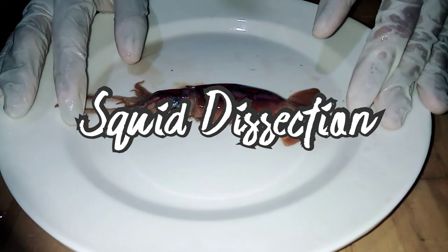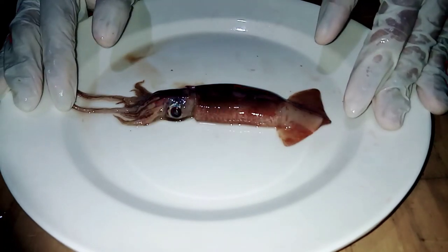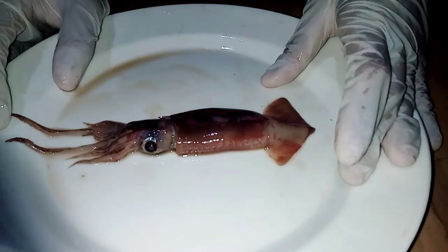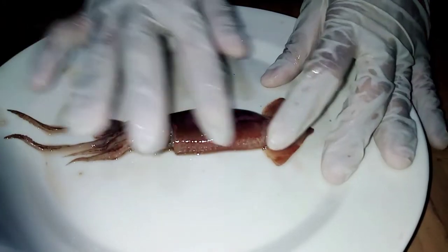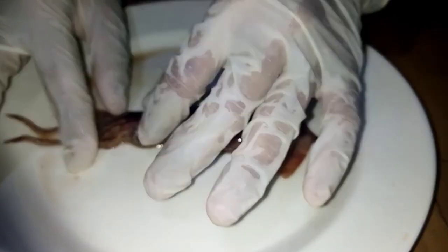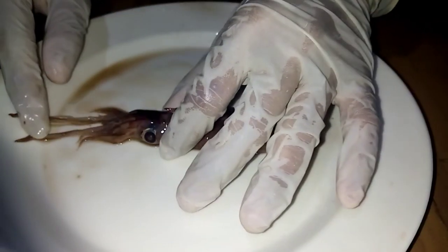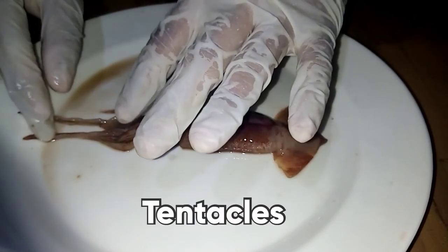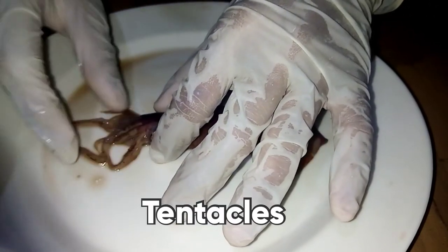So I am going to dissect a squid to identify the external parts and internal parts of it. These are the external structure of this squid. As you can see this part, this is the arms or tentacles of the squid.